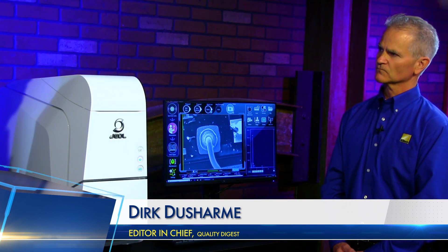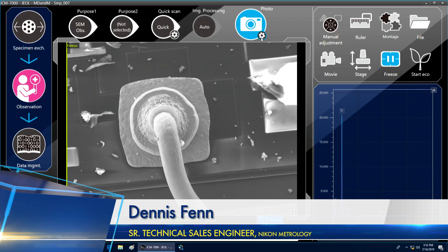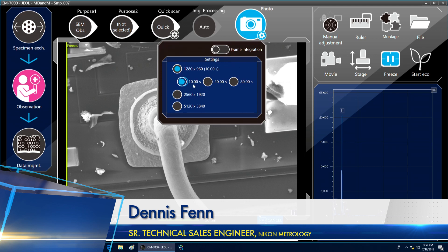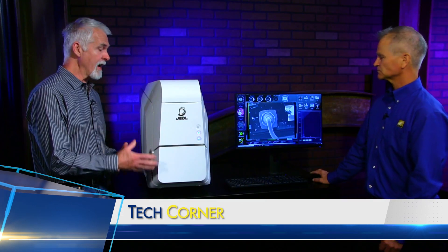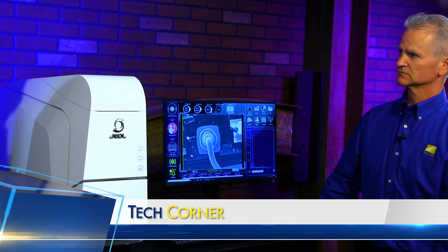How long does it take to scan an image? That right there was to scan an image. I have some options on how I do that — I can collect an image in 10 seconds, 20 seconds, or 80 seconds. I can also choose different resolutions for the micrograph. This system gets down into the 20 nanometer range. That's really small.